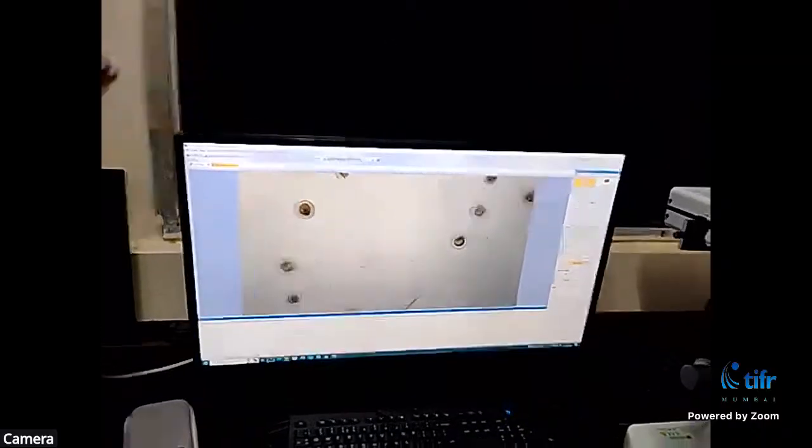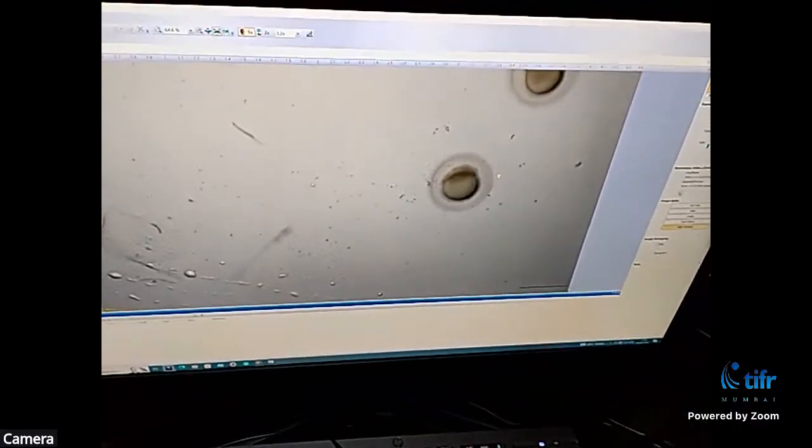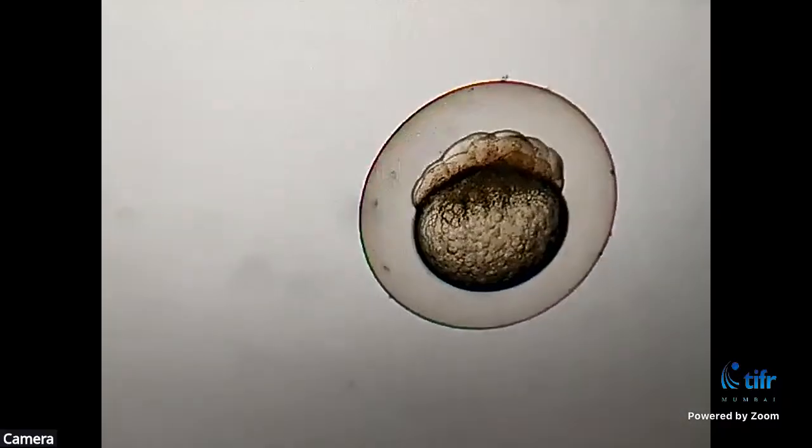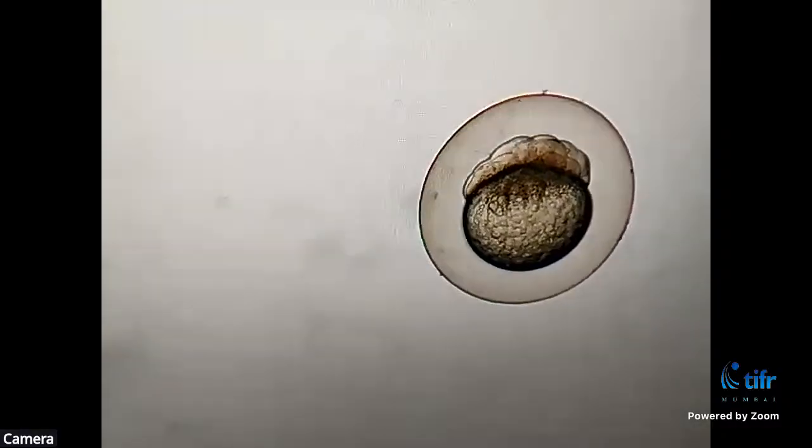I will focus on one embryo. Now I'll be explaining what the structures are that you are seeing.